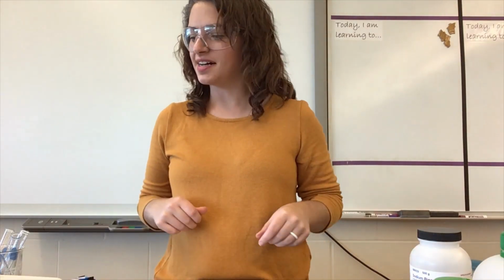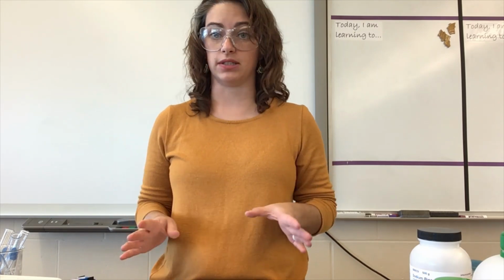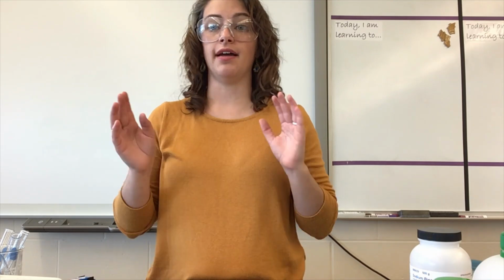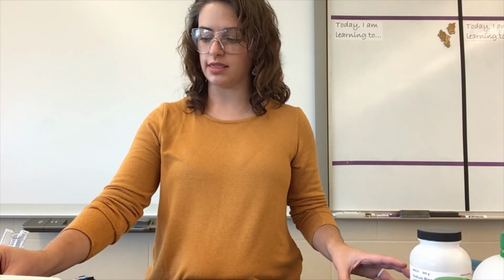A little hot. That melted very quickly, so it definitely has a low melting point, because that for sure melted, and it melted very quickly. Probably don't need my hot plate quite that hot.